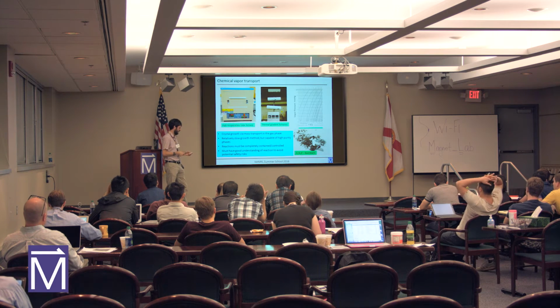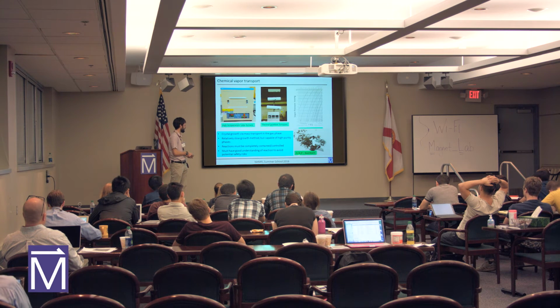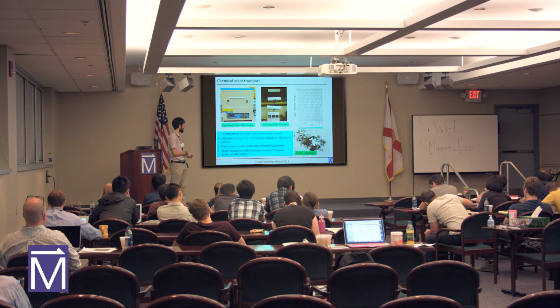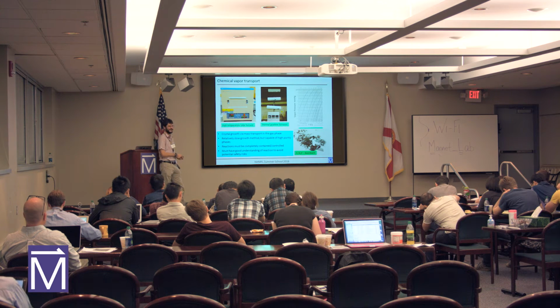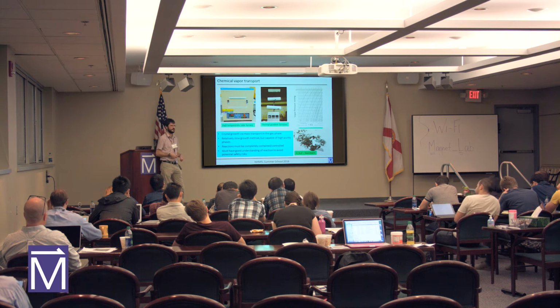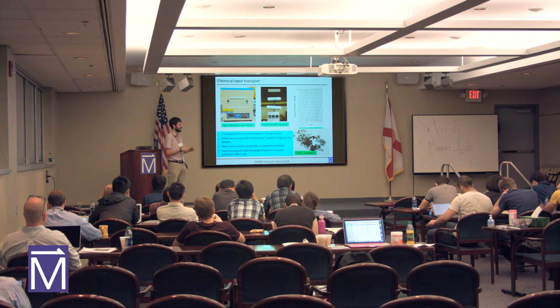Okay, last technique that I want to tell you about that is really powerful is chemical vapor transport. The idea here is that you may make a polycrystalline precursor of some material. So for instance, we've recently been working on a Dirac metal, zirconium-2, tellurium-2 phosphorus. And actually note that these are high vapor pressure elements. So this is one way to deal with your high vapor pressure elements. So you'll make a polycrystalline precursor of this, and I can promise you that the polycrystal did not look like this. It looked awful. And then you can take some iodine, or there's other vapor transport agents. But what makes a good vapor transport agent is that it should have a high vapor pressure, and it should be kind of reactive with the stuff that's in there.